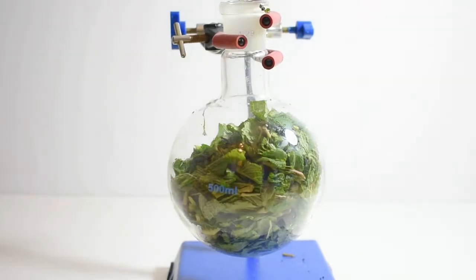Now that the mint leaves are in the flask, I can set up the apparatus for a steam distillation. This kind of distillation uses water vapor to pull the oils out of the mint and over a distillation apparatus so that the mint oils can then be separated.